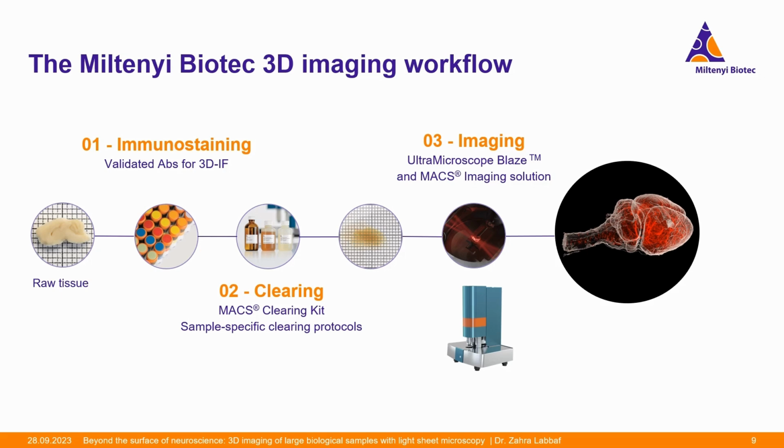At last, for 3D image acquisition, we have 3 light sheet microscopes. However, due to time restrictions in this talk, I will only focus on the UltraMicroscope Blaze. In the next slides, I will go into more details of each step of the 3D imaging workflow.